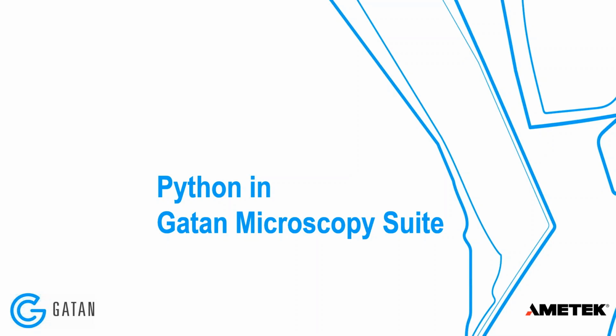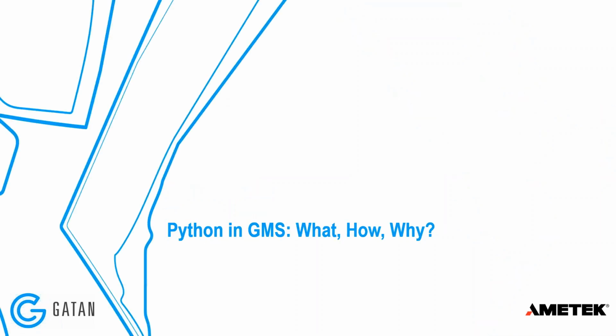Instead, this presentation is really meant to demonstrate the potential of Python scripting within GMS. And I really hope to inspire many of you to write your own scripts, and also maybe to partner with me or with others within Gatan to collaborate and help us help you to get the most that we all can out of scripting within GMS.